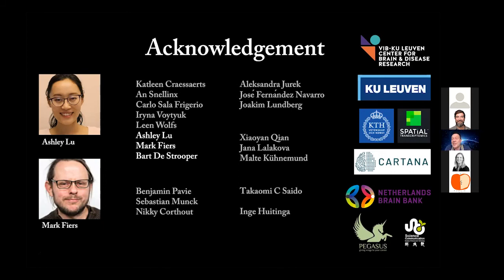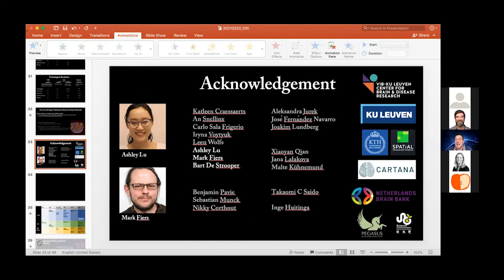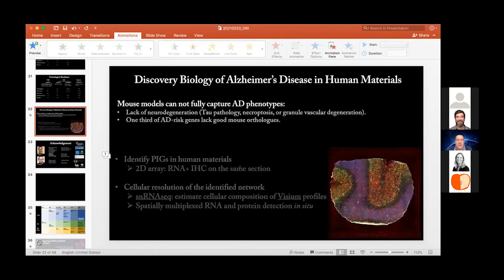So we've got lots of questions. The first one is right off my heart, from Axel Montaigne. He writes, "Great talk, thanks. Can you look at vascular cells, so these endothelial cells, pericytes, smooth muscle cells in your AD models?" And for those of you who don't know, it's very difficult to look at the vascular cells. They're very difficult to free. They're captured in a lot of extracellular matrix. So looking at the vascular component in these single cell approaches is often really underrepresented. So Wei-Ting, can you see these vascular components in your spatial transcriptomics?